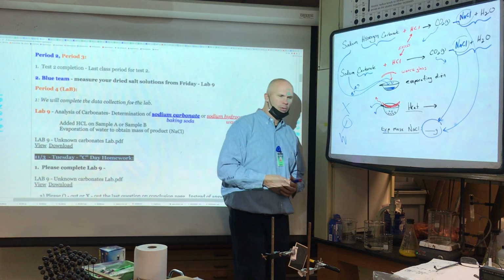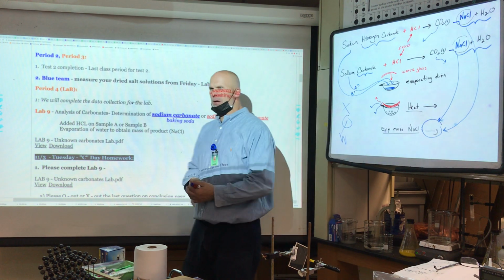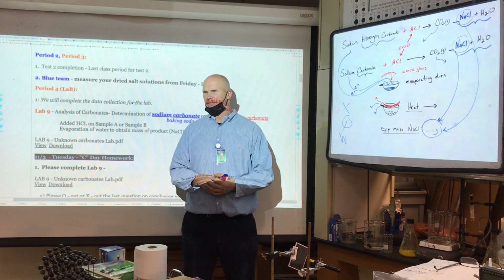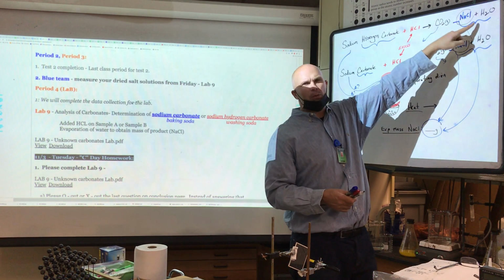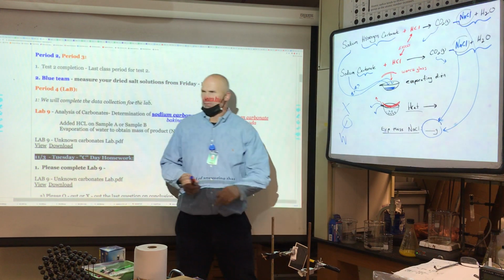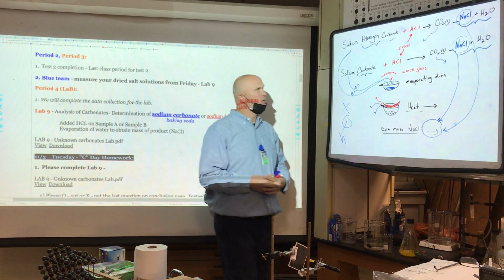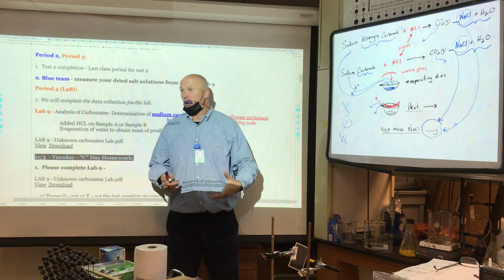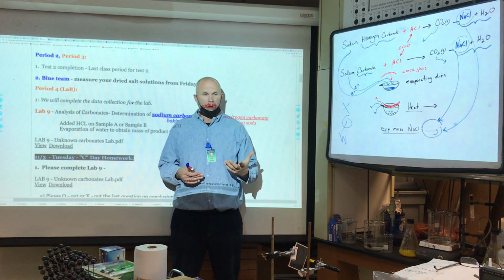Number 2, separate a mixture by evaporation. You learned this summer that sodium chloride dissolved in water is a solution. And you could separate a solution, at least the solute, by evaporating off the water. It's what the indigenous people did, or it's what we did as earlier settlers to get salt. Salt was an important product for civilization.